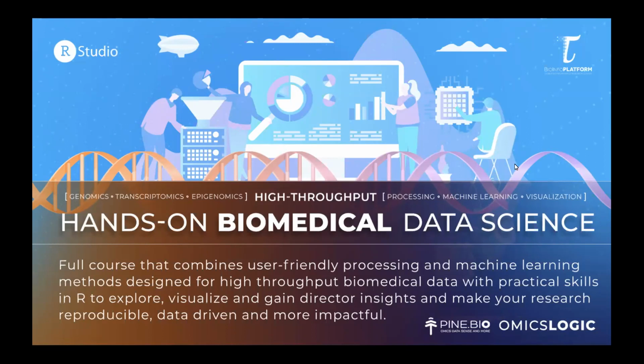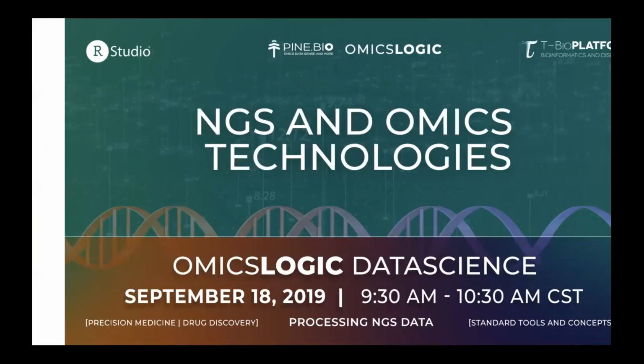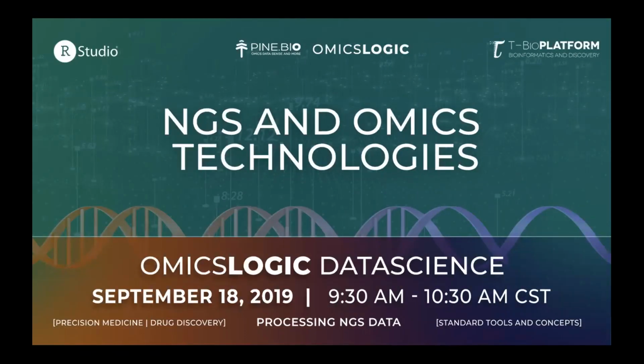When we talk through this session today, we'll be focused on next-generation sequencing and omics technology. So we'll talk about a variety of different use cases for this type of technology, and about different tools that you can use to process and analyze this kind of data.